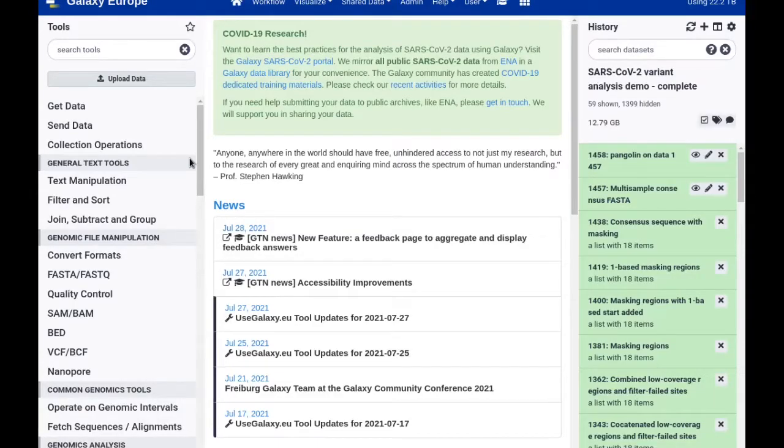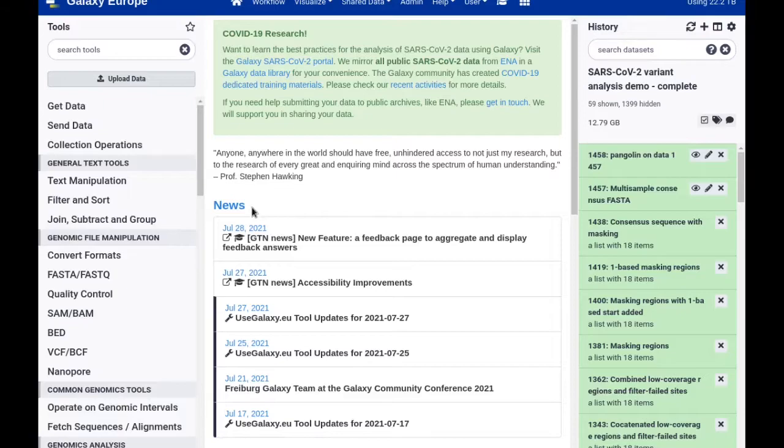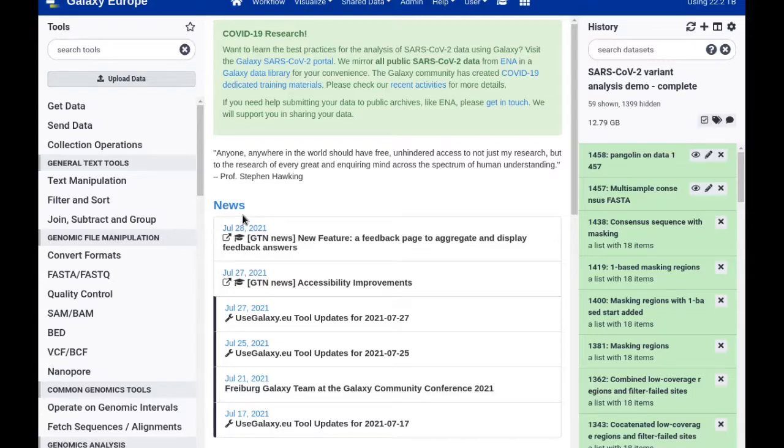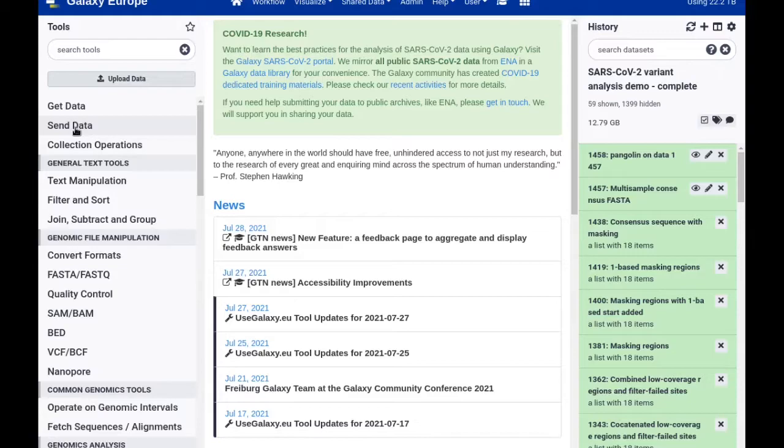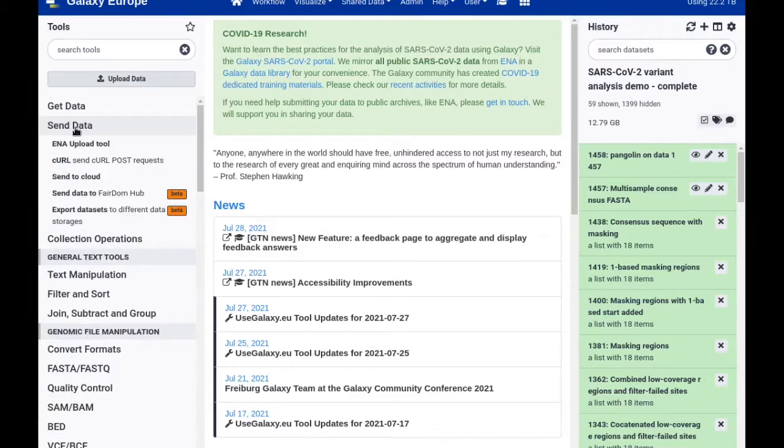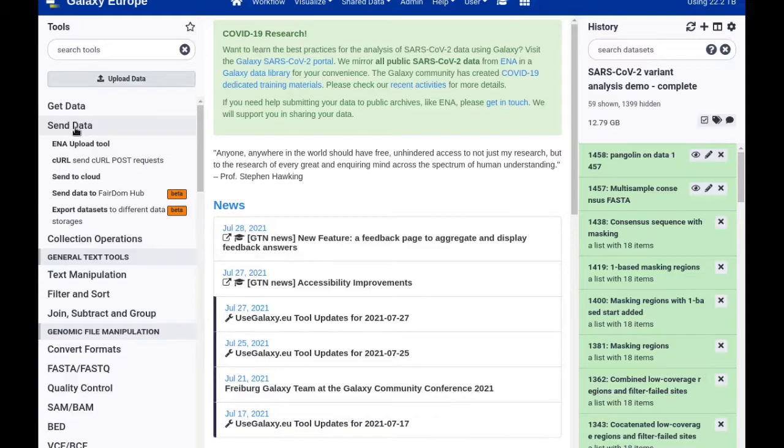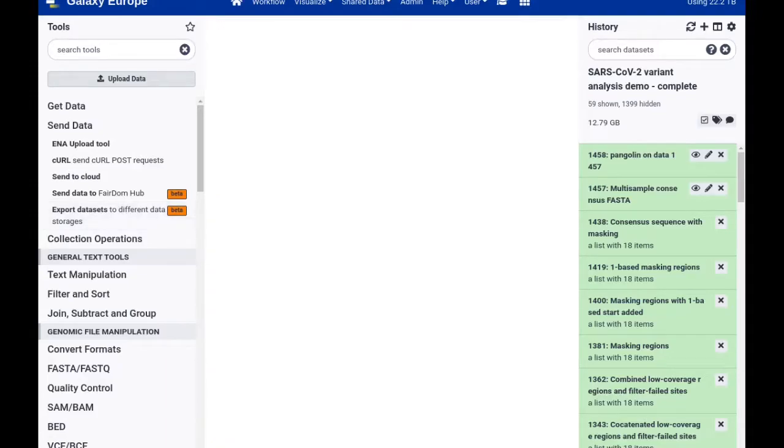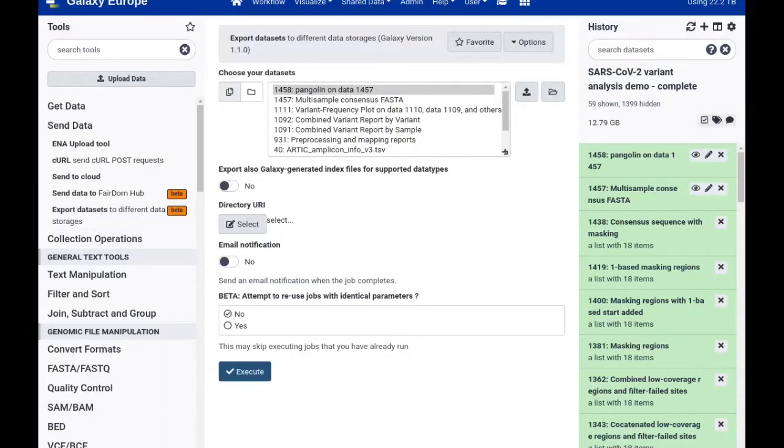What I can also do however is use a dedicated tool to export data to any folder on the configured data store. That tool can be found in the send data section of the tools bar, and it's called export datasets to different data storages. Selecting this tool brings up a tool interface like for any regular tool.